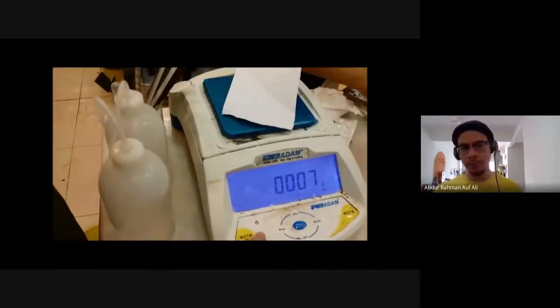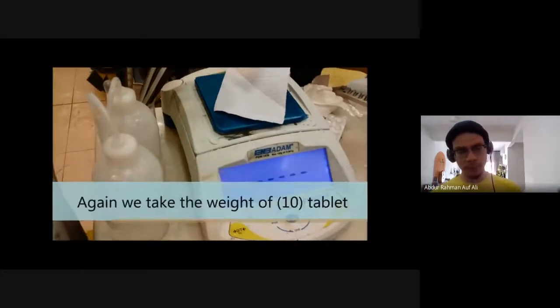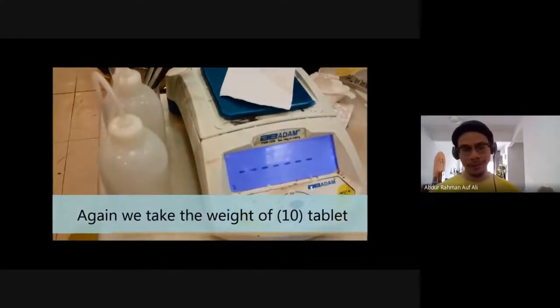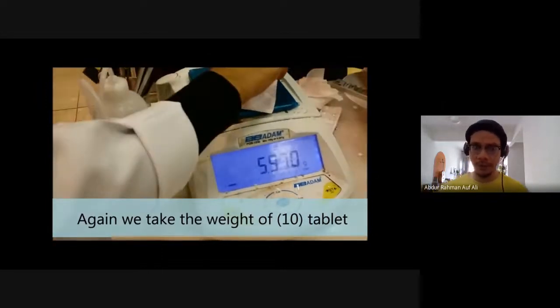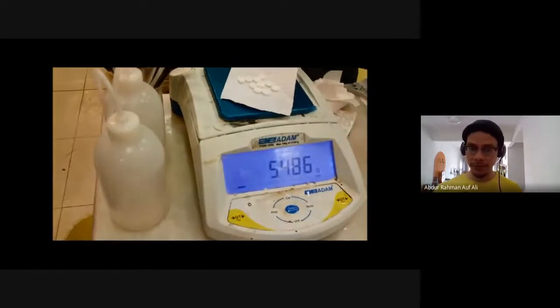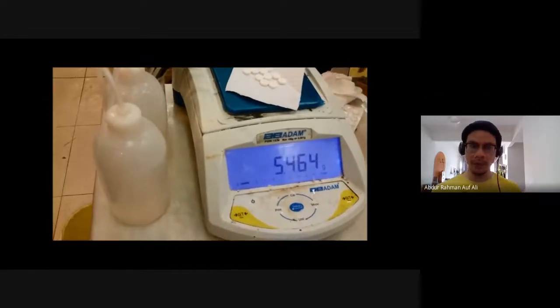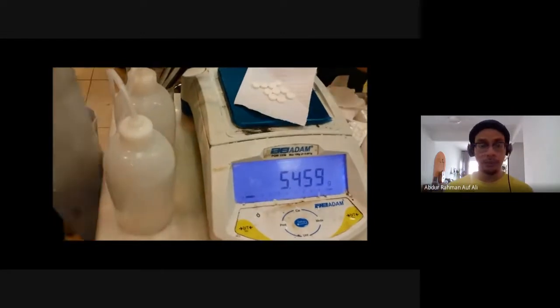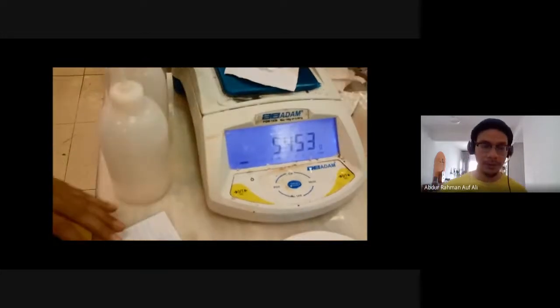So sometimes the problem early on, in the early stages of shipment, they noticed some of the tablets akan pecah. So this is not good for business, and also not good for the customers. They cannot consume tablets that are broken into pieces. So this will count as a loss, rugi company, and then patients tak dapat the drugs yang diperlukan dalam masa yang sepatutnya. So in order to prevent this from happening, we test the tablets out.